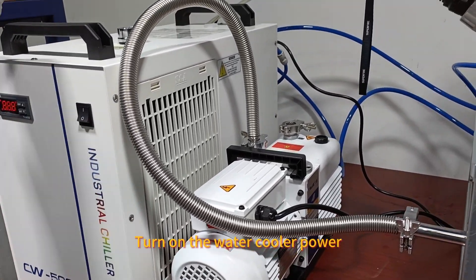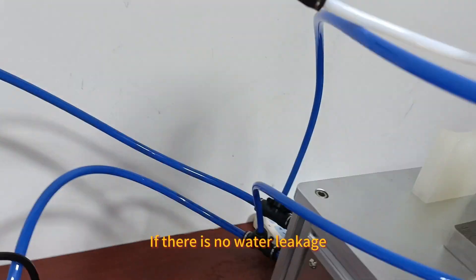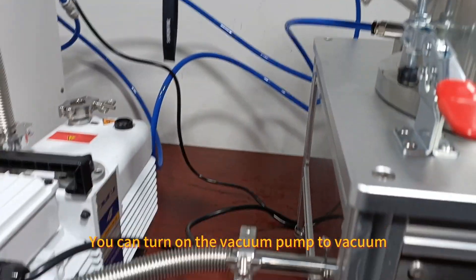Turn on the water cooler power. Check for water leaks. If there is no water leakage, you can turn on the vacuum pump to vacuum.